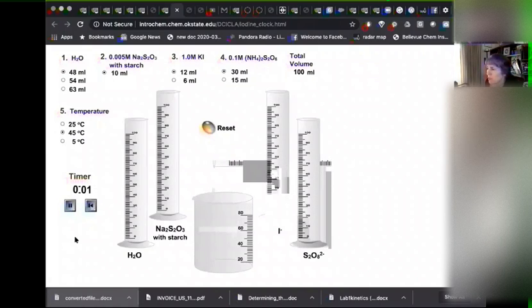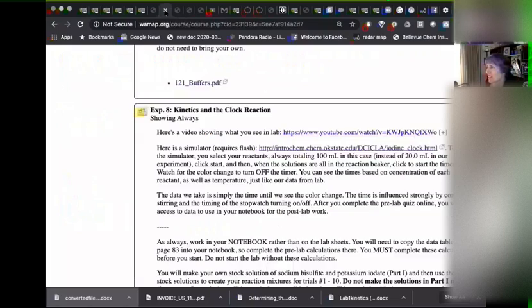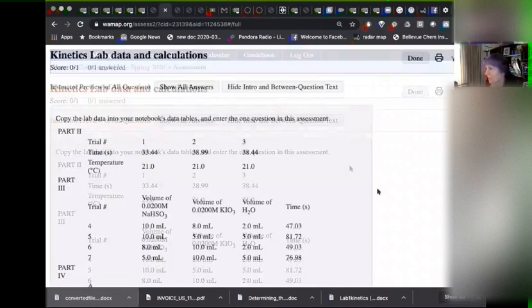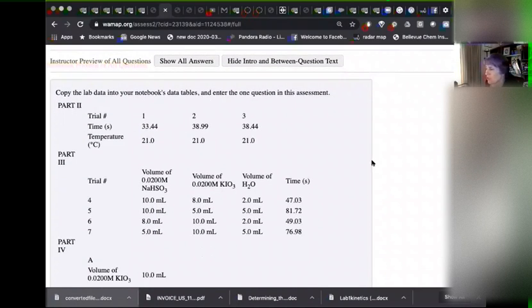All right. And stirring, stirring, stirring. In the lab, you just have to stir the whole time. Whoa. So that one went really fast. So we see the same kind of thing in our data here. All right. This is the data you should write down. So copy this data into your notebook. And then there's one question in this to give a point for getting the data.